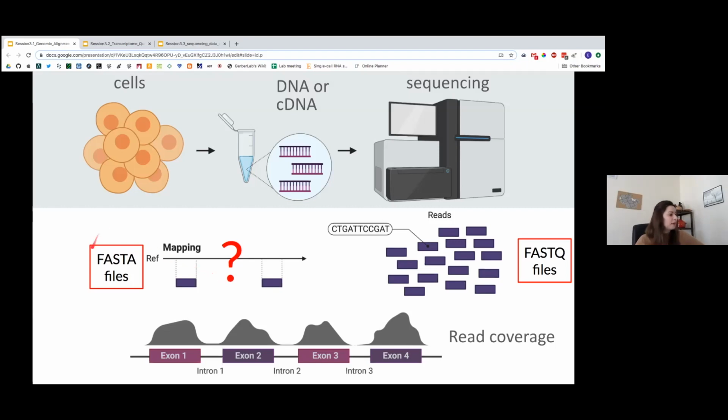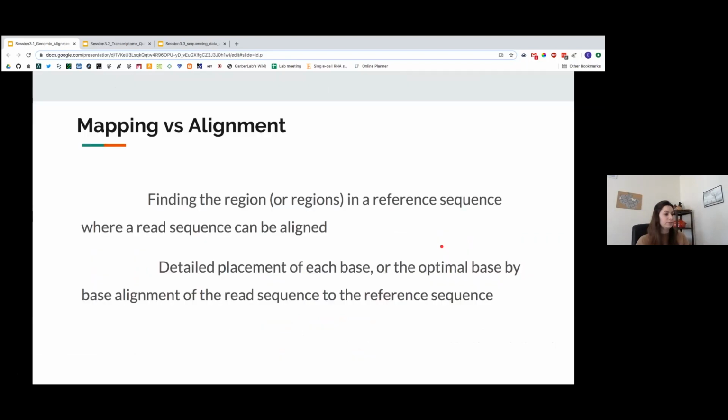And now you know also that the reference genome for the mapping is contained in FASTA files. So you have all the bases to get this process started. All right, so after the mapping, we can generate the coverage profiles and start to interpret this information. So we'll go through the analysis that we mentioned for RNA-seq and for genome alignments and go into some details.